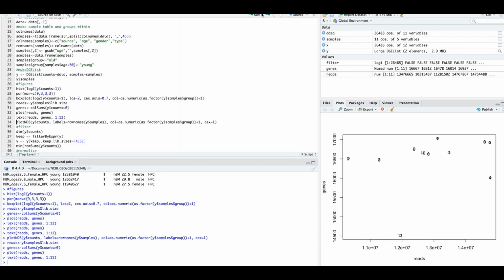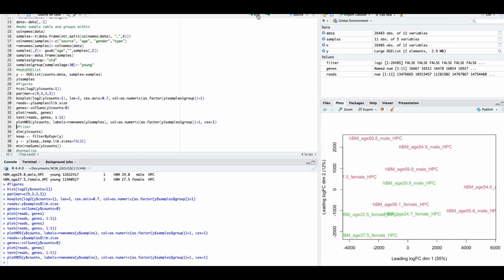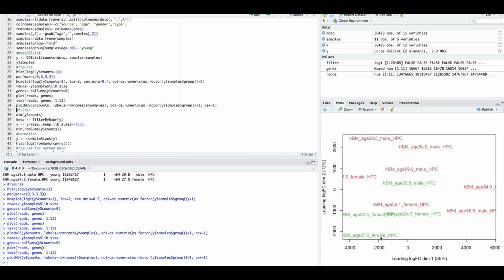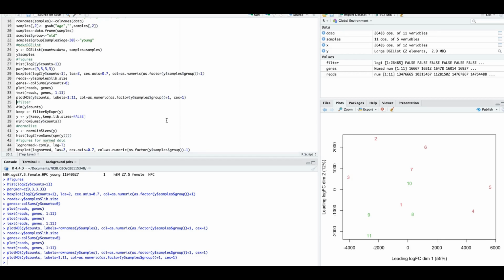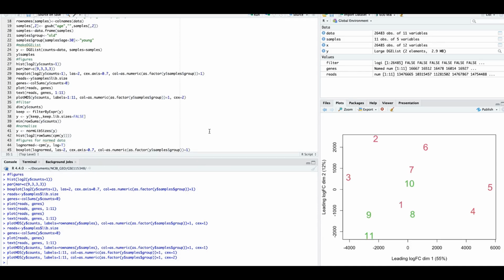And then we plot MDS, that's limma. And if you are confused with these long names, which are simply the first column over here, you can work with shorter names in your sample table, or you can simply say labels are 1 to 11. Then it's somewhat easier to read, and if you don't see it well, you can increase the font. Now you see it well, and you can also add a title, that's okay.